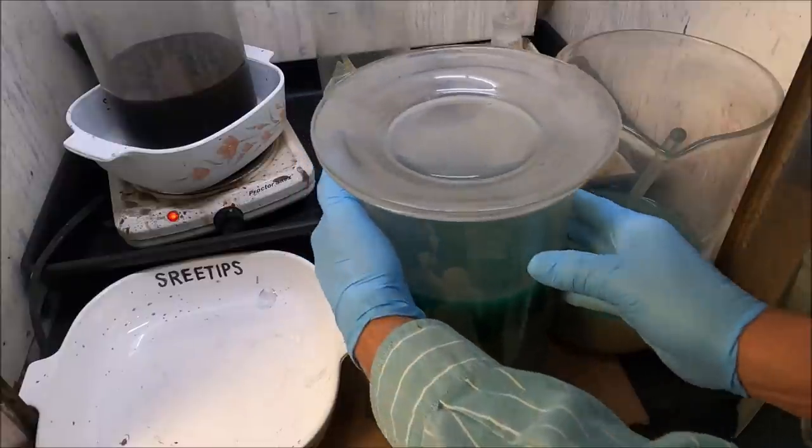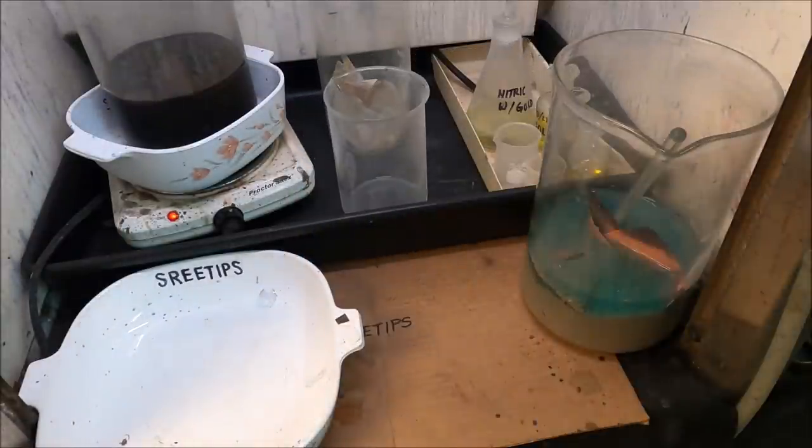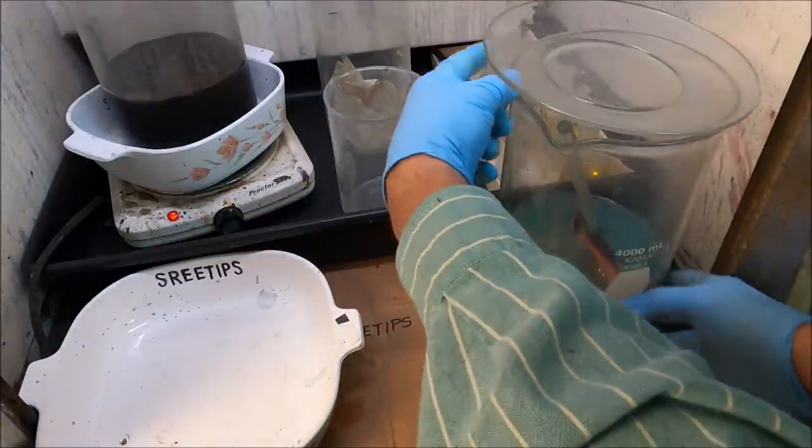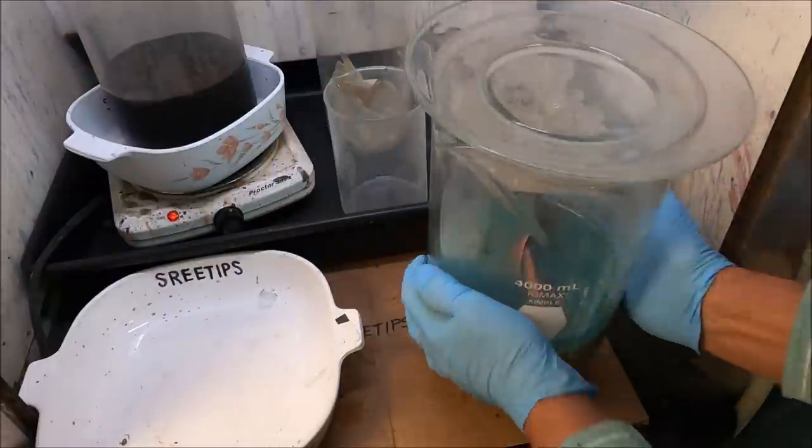These two big beakers of silver up out of the way now. Those concentrate on the beaker back here that we've treated with hot dilute nitric acid. Get this down and see what we got in there.